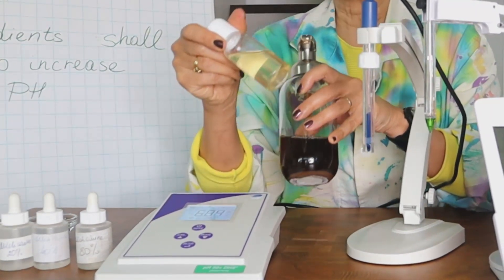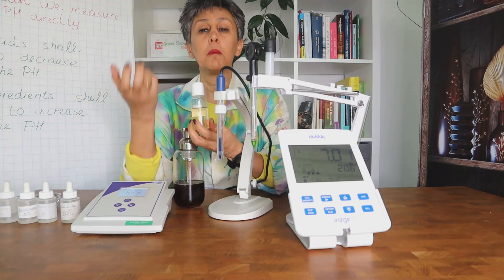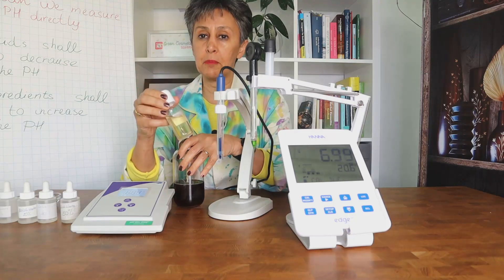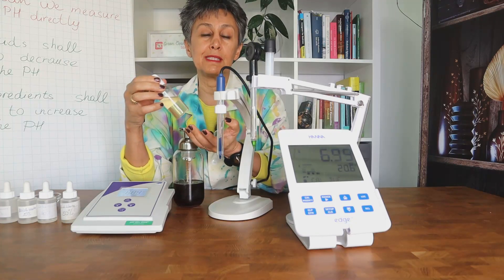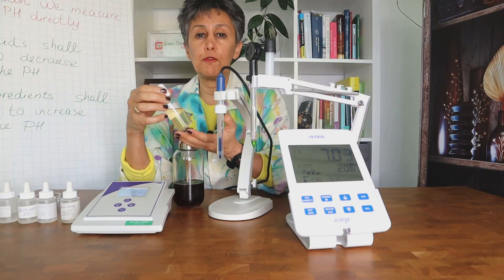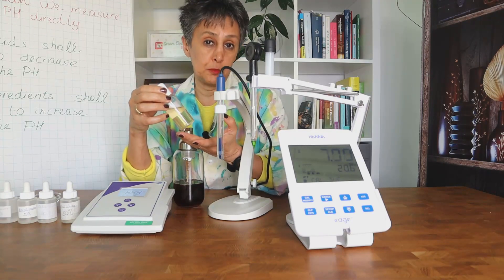Still, you need to take a sample — you do not immerse the electrode directly into the bulk of your product, because you don't want to cause any cross-contamination. You take a sample, measure the pH, then discard that sample. When working in a small laboratory with small batches, this means taking lots of samples. With a 500-gram batch, you can sometimes lose about 100 grams of product to pH measurement.